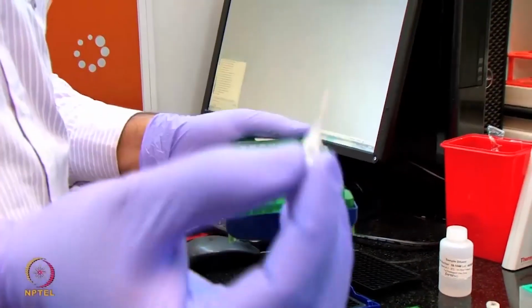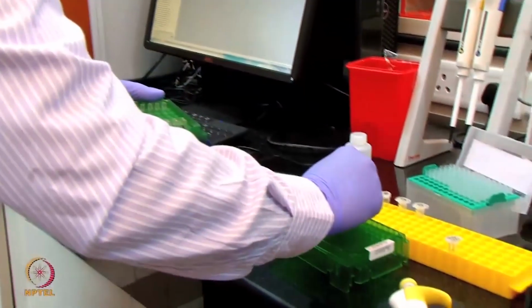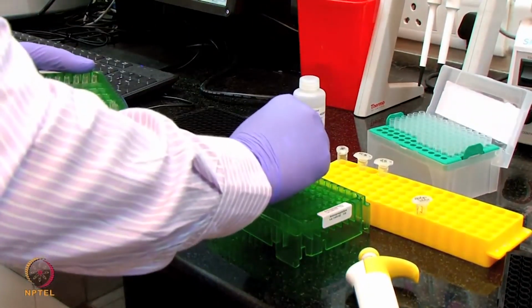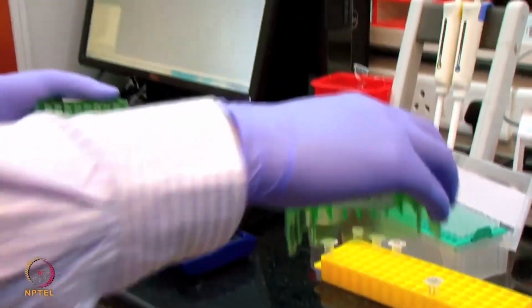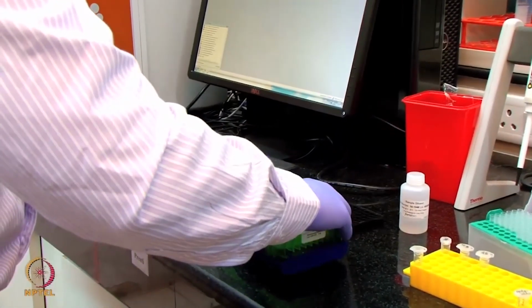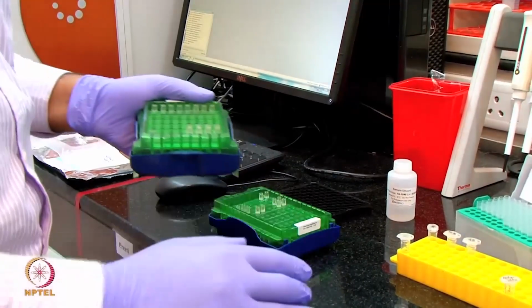These are the sensors, they look like this. I am going to put them onto the sensor tray. This is the sensor holder tray. I am putting the sensors like this. Now I am keeping this sensor tray for hydration for 10 minutes. So now I will set aside these sensors for 10 minutes.